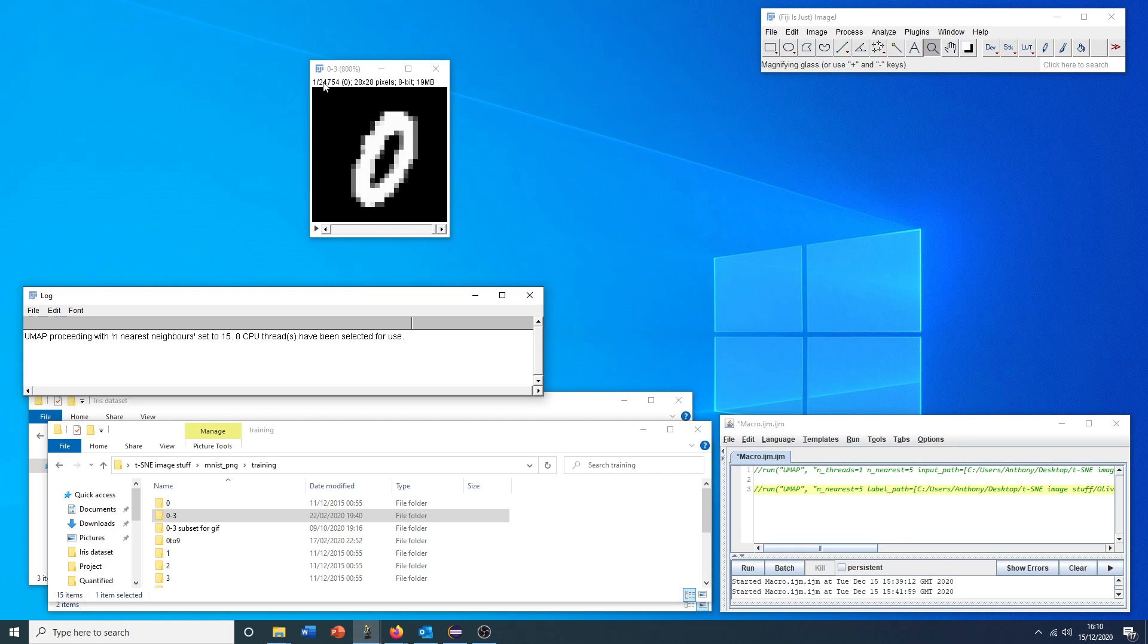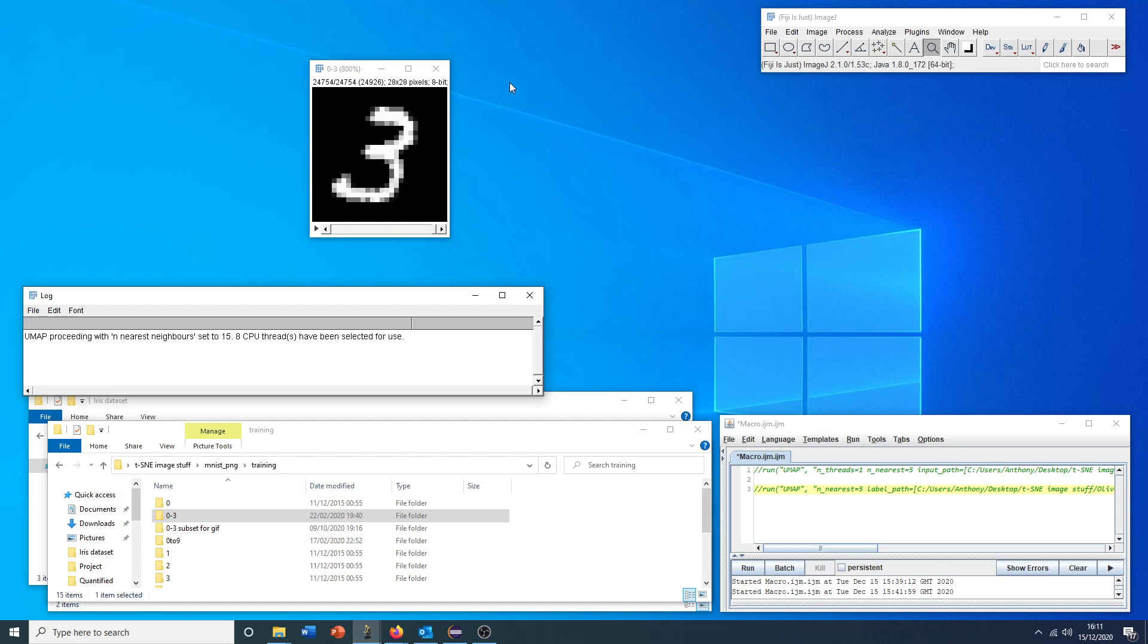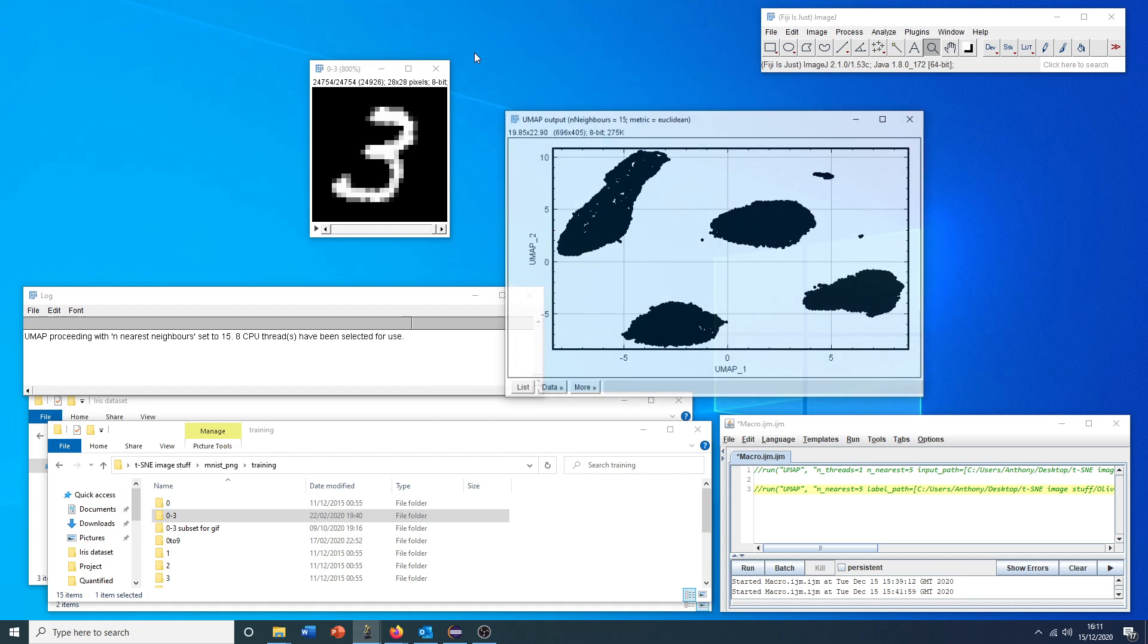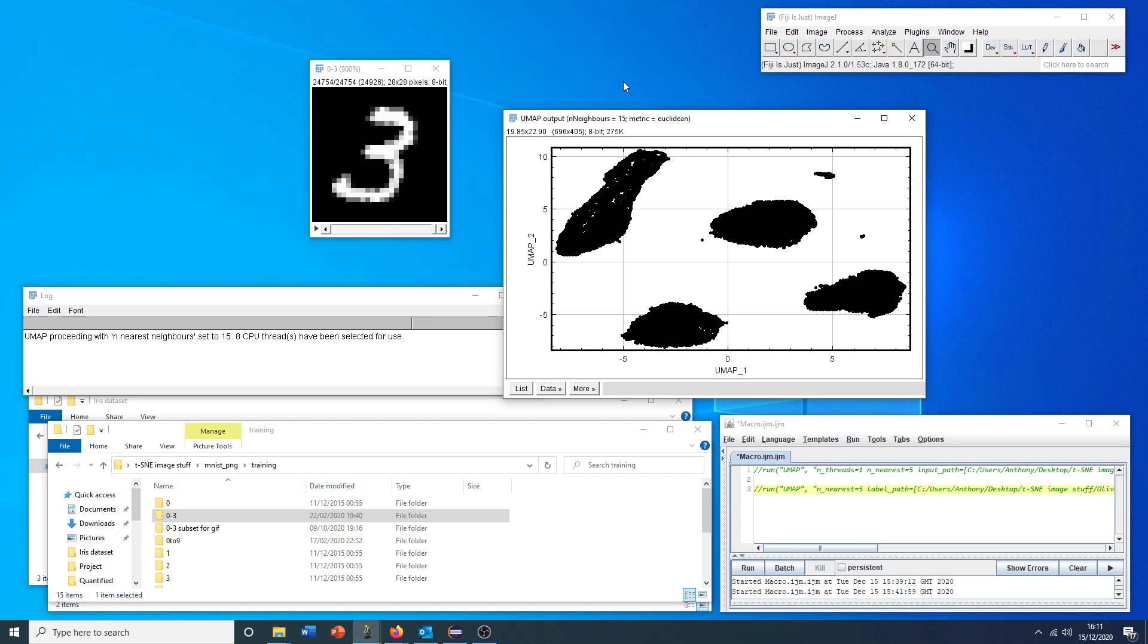For this number of images, close to 25,000, this shouldn't take very long. I expect within the next 10 seconds for our results to be presented to us. And here we go.